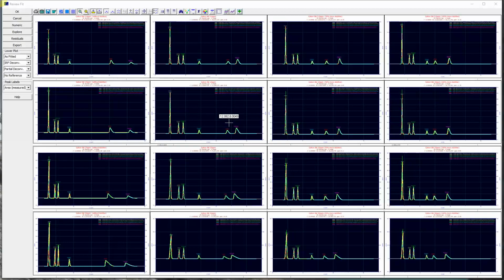One of the advantages of fitting convolution models is that we automatically perform an accurate and noise-free deconvolution. In this review, we will display 2 deconvolutions. One, the peak with the IRF removed, and the other with both the IRF and all third moment non-ideality removed. This will be the pure HVL peak that would exist if there were no IRF and no asymmetry in the HVL's core density. We will first look at the lowest concentration of the most fronted peak, a lithium, with no additive.